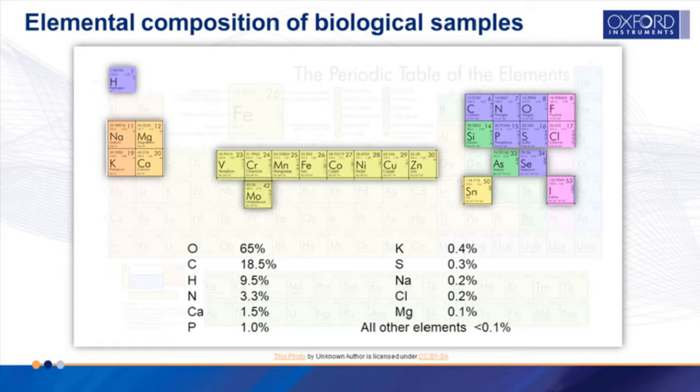Over 50% of enzymes depend on metal ions to function, and over 3,000 proteins alone require zinc. EDS is a technique that can help us answer some of the questions that have yet to be answered, and the recent improvements in detectors and processing technology have made the analysis of biological samples not only possible, but fast and a routine method that can be incorporated into any microscopy lab.